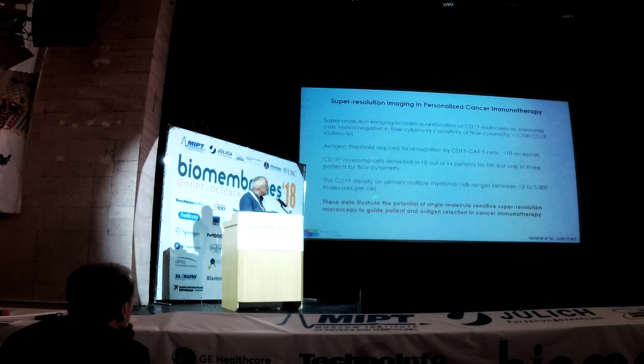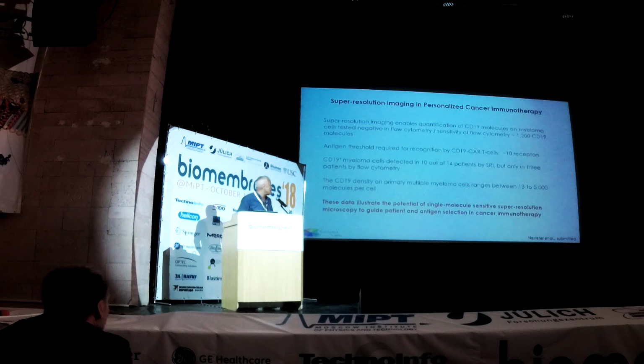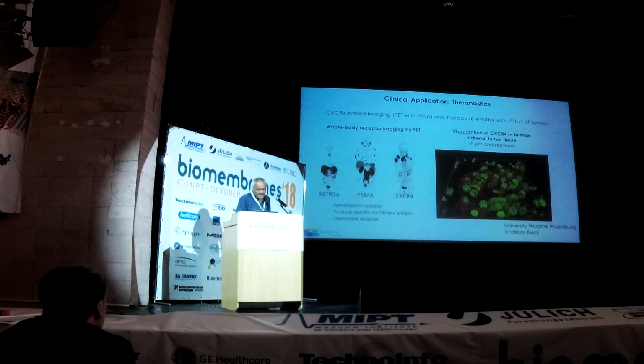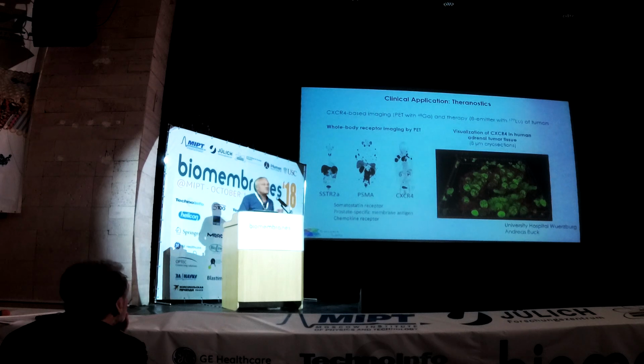I think that these new super-resolution techniques can be used advantageously to improve the efficiency and the safety of personalized cancer immunotherapies. And this is what we're doing at the moment. We even started to work with tissue imaging with high sensitivity. So this is something coming up as well. You visualize the distribution of some tumor-associated receptors or antigens in the plasma membrane by using an antibody, or in most cases a peptide.